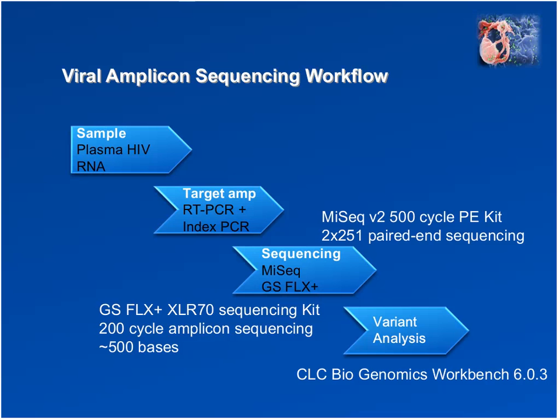So why did I use that application? It was also because Illumina doesn't have an amplicon variant analysis software that will accomplish those tasks. But really, that's okay because this application works very well.